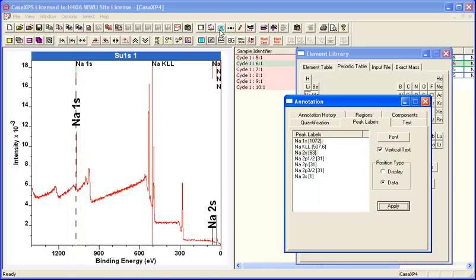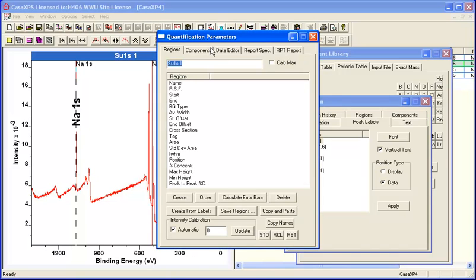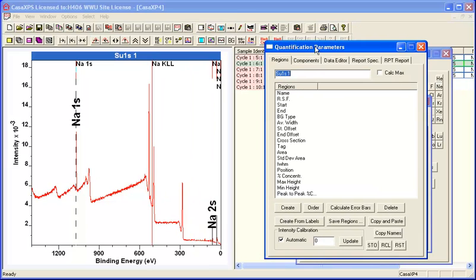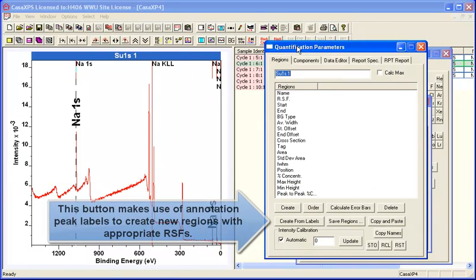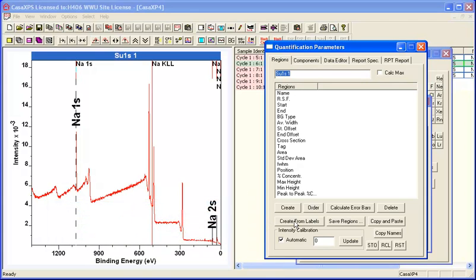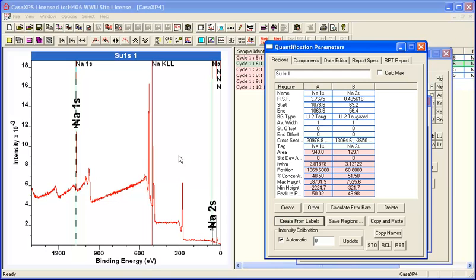When I bring up the quantification parameters dialog window, there's a button that says create from labels. Typically, you would only create one region per element to quantify how much sodium is present. But in this case, I want to verify that these peaks are comparable in this measurement, so I'm going to create a region on each one using create from labels.